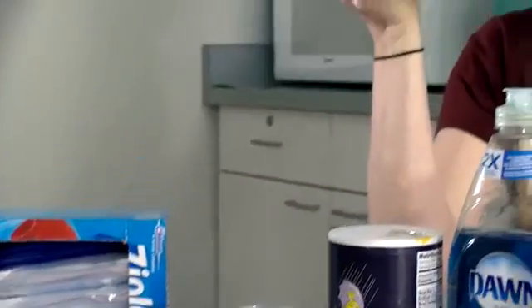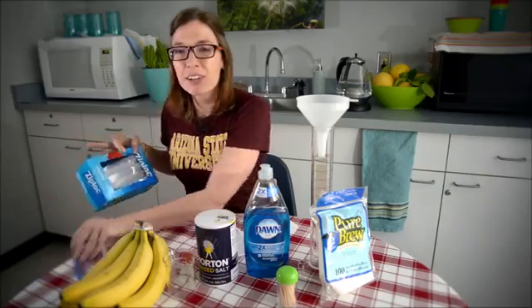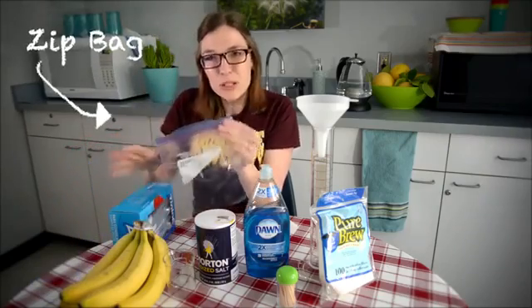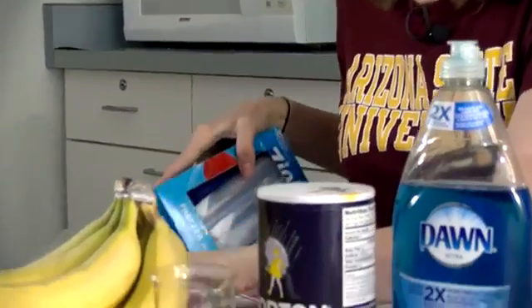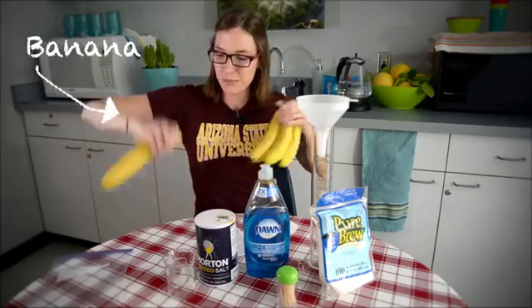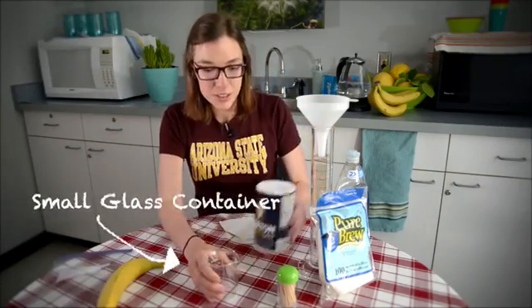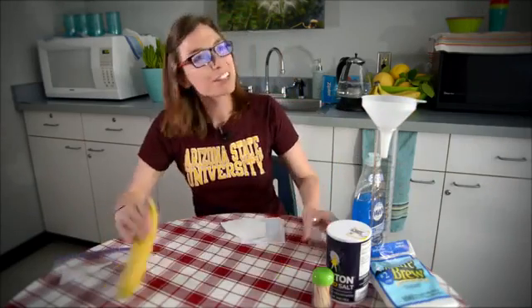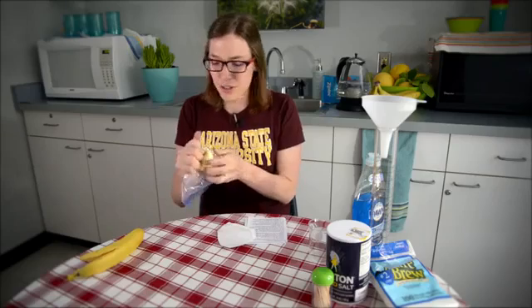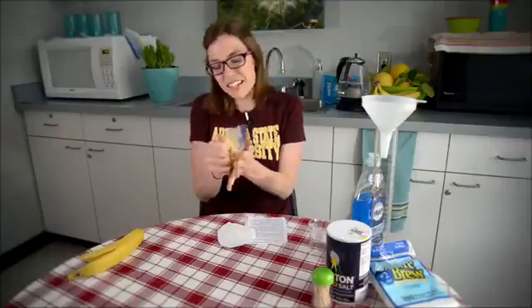Today we are going to extract DNA from bananas. Any sort of bag with a zippy top will work, just because you're going to be mashing bananas in here and you don't want it to get all over everything. We have one of our bananas and a container for our warm, salty water that we'll be using. So let's first start just by mashing some bananas — this is the fun part. Just get in there and mash it up, probably about a minute.